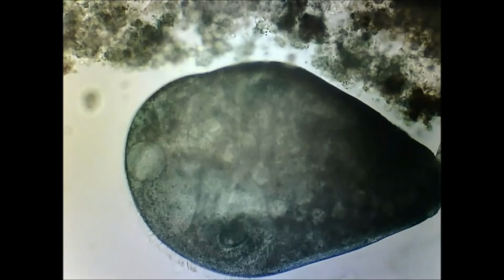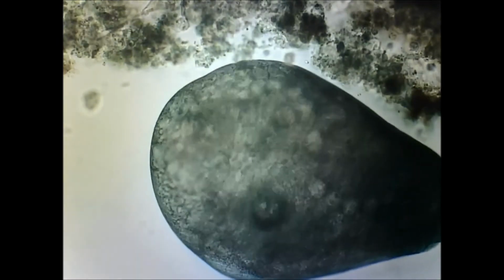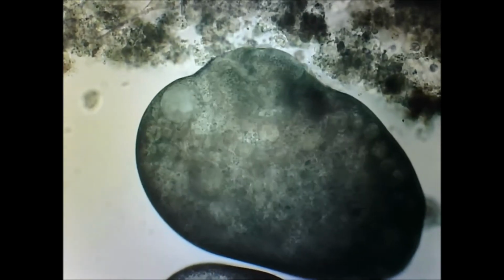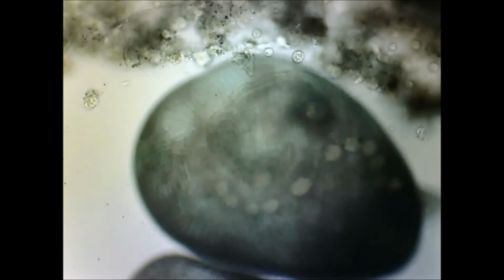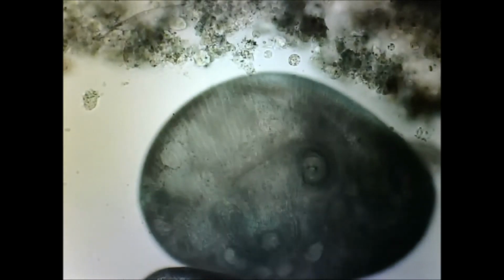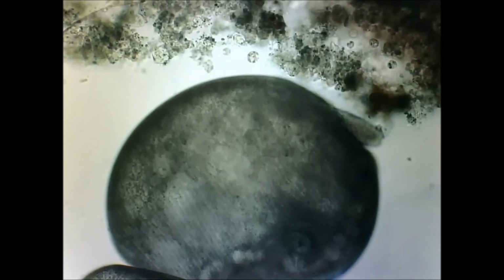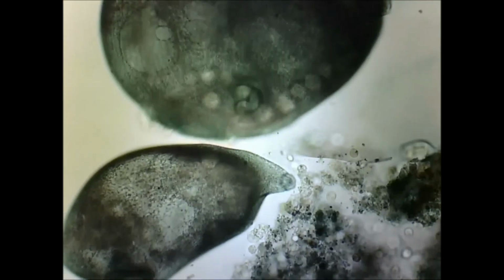Now notice the chain of beads. It looks like a string of beads there in white, and those are the nuclei. Unlike human cells, which have one single nucleus, this creature has multiple nuclei, in some cases anywhere from 5 up to 10 or 15, and they're in a string there. It's not well understood why that is. That's a big question for any of you interested in going into Stentor research.